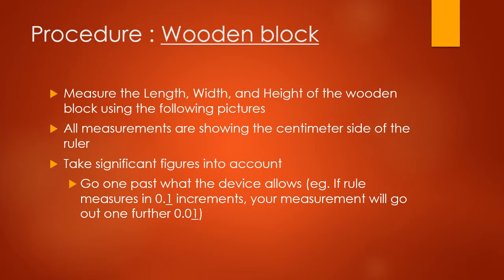You're going to use the following pictures to get those measurements, and you need to make sure that all measurements are measured in centimeters. Okay, and the pictures will show the centimeter side of the ruler. Make sure that you take into account significant figures, which means when you're using a ruler or any other device, you want to go one past what the device allows.